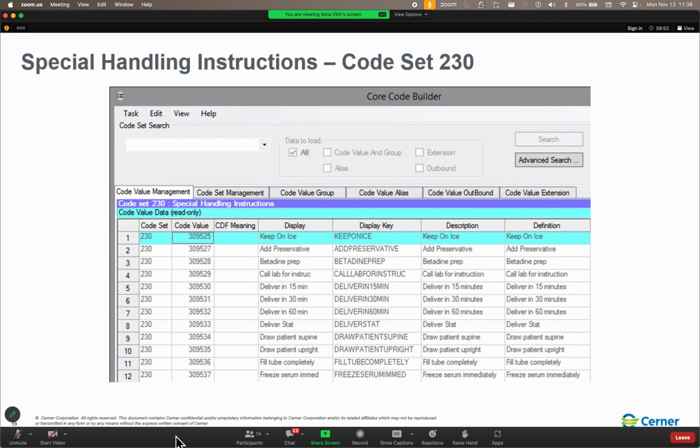And if somehow an add-on order was actually added to a collection list, it's not going to leave that collection list early to join anybody else's order. So it is the way it is. I'm not going to join you. You're not going to join me.